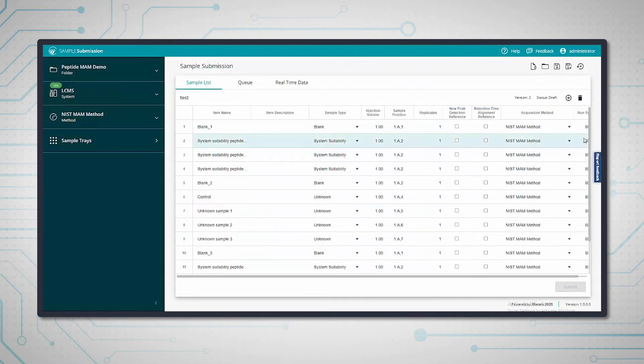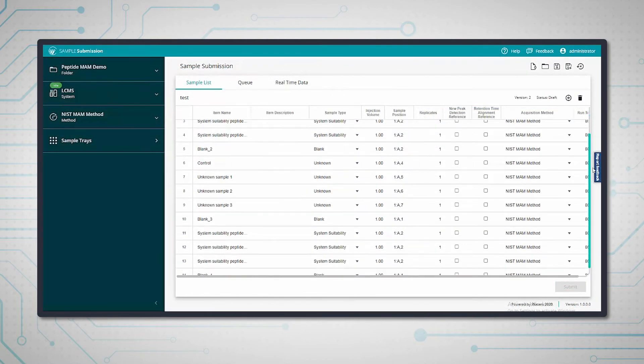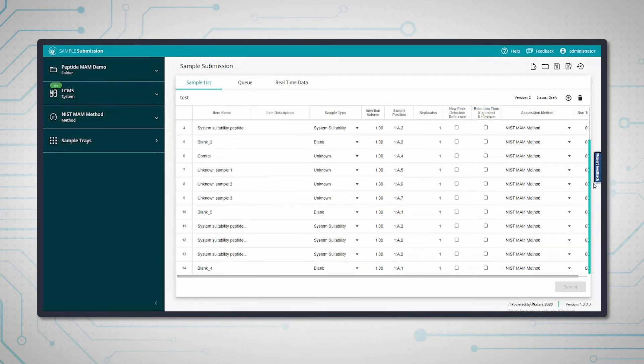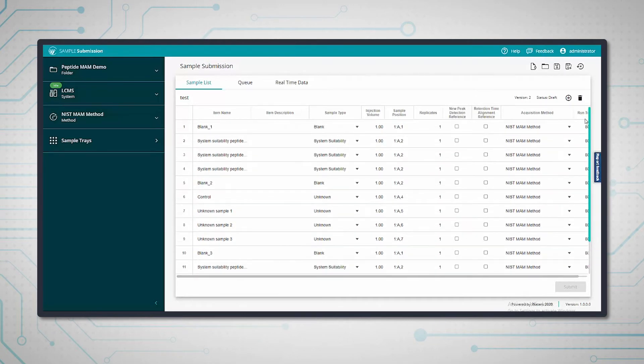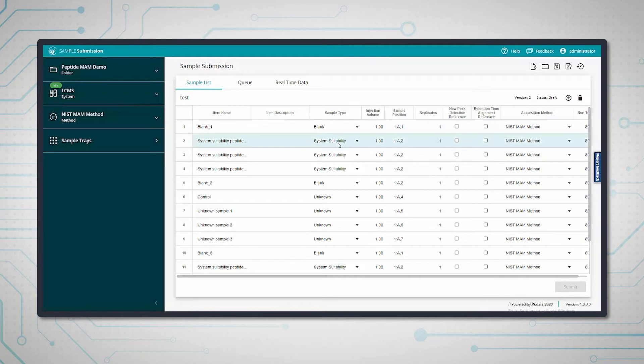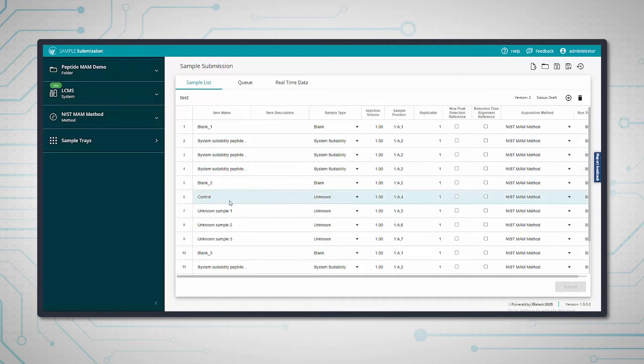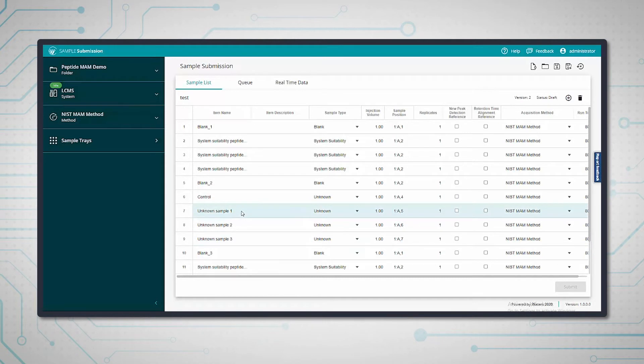We have a set of 14 different samples here consisting of a mixture of blanks, system suitability test samples (the SSTs), a control, and three unknown samples. It's quite a small sample set, but it's just to demonstrate some of the key features of the software.